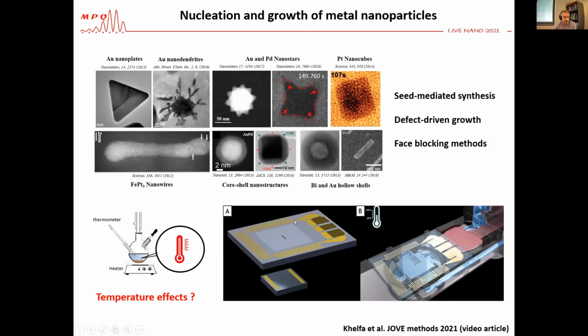of temperature-controlled liquid cells, in which you have a resistance that is embedded inside the silicon wafer that allows to homogeneously heat up the whole liquid inside the liquid cell from room temperature to 100 degrees.